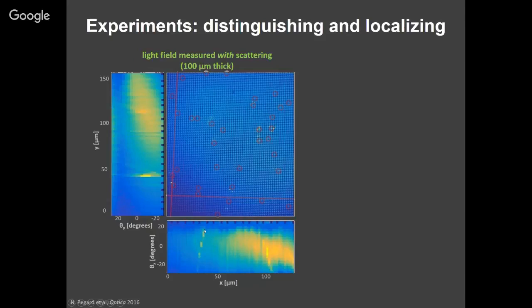And what you see is stuff that's near the surface still shows up as these lines. This looks similar to my simulations, but highly pixelated. And stuff that's not near the surface is highly scattered out, right? So this is what your epipolar plots look like, but actually we have the whole 4-dimensional thing.